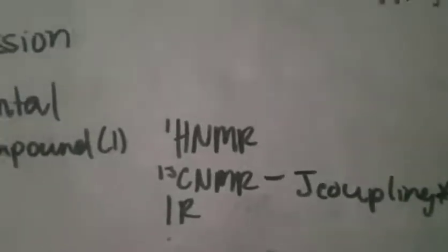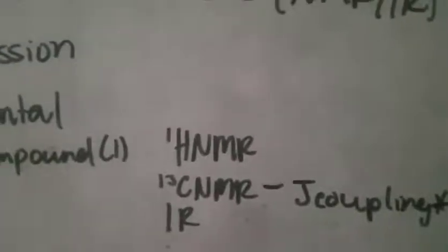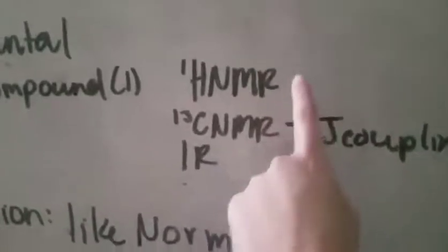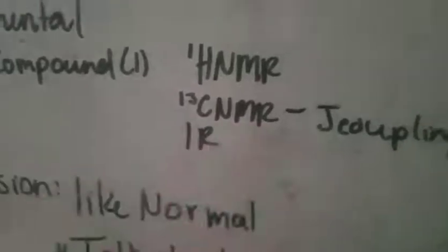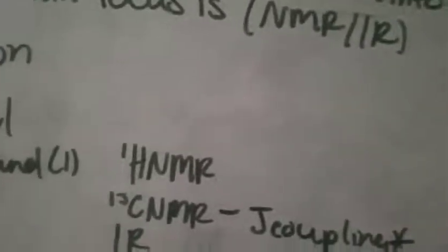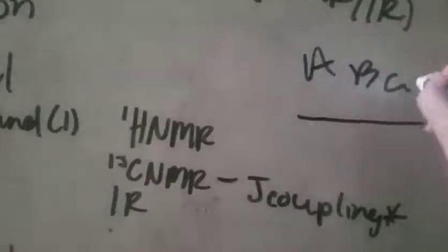So aspirin, you got it by doing 1-to-1. Caffeine, you got it by doing 1-to-2 solvent. You ran it through. Put your conditions for that. And then you're going to have a row for NMR, a row for carbon NMR, and for IR. Because you should already have it annotated, those spectra we have uploaded, you should have them already labeled out with the A, B, C, D like we did. Same thing like what I did over here.